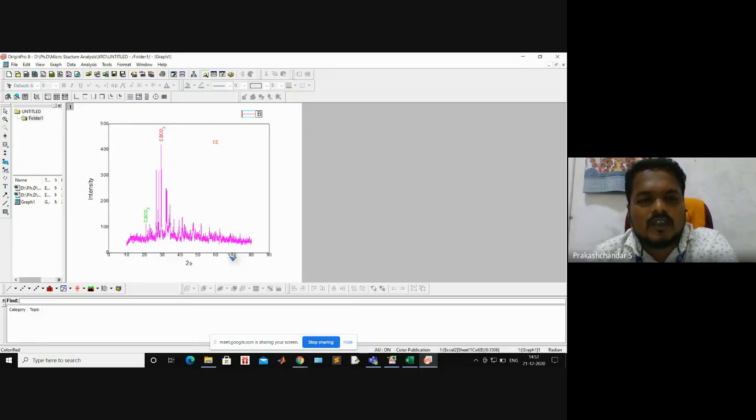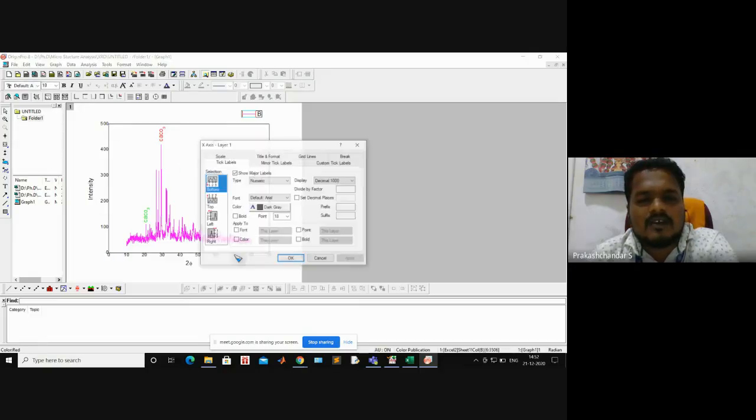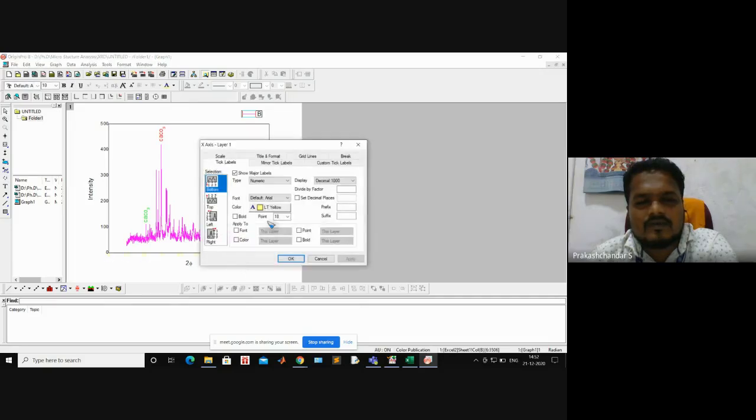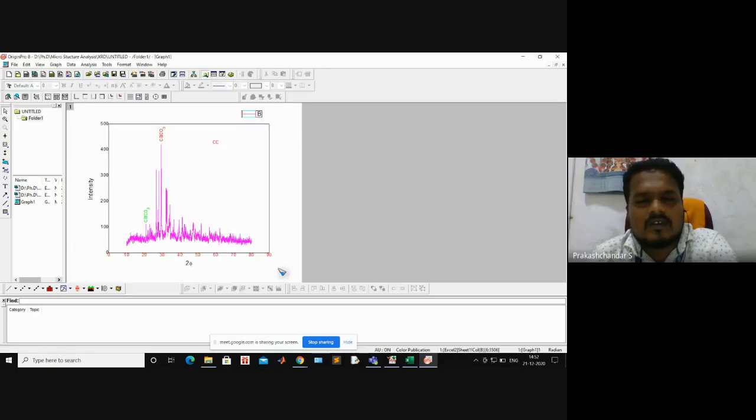You can make it here, also color, whatever you need you can change it. Like this you can change it. So this is, thank you. This is a small tutorial on how to draw XRD graphs.